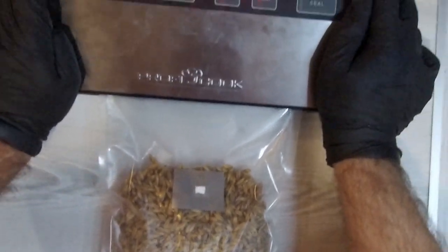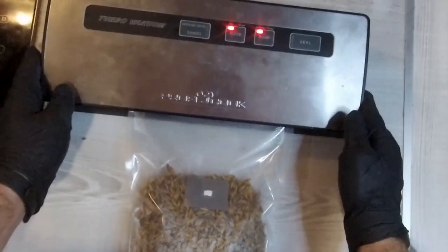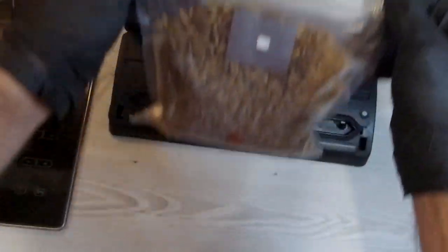After filling, we can seal the bags with a vacuum machine, and then they're ready for sterilization.